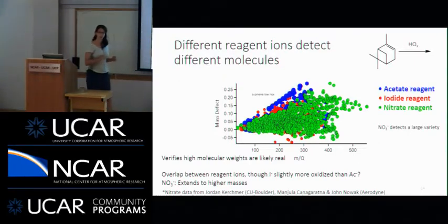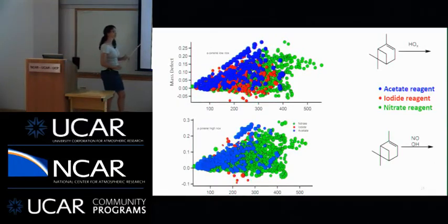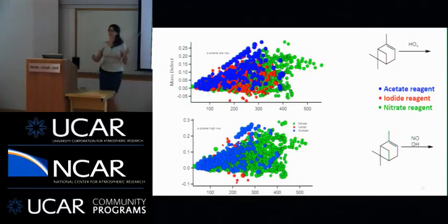Yes? Have you basically decided that those are all carbon, hydrogen, and oxygen? They are not all. For the purposes of this figure, I believe we eliminated all the heteroatoms. Oh, no, that's not true. We actually included them, but this was a low NOx experiment, so there were almost no heteroatoms in here. So no nitrogen and sulfur in this figure. But in the next plot, I have the data from the exact same experiment, alpha-pinene plus OH, but in this case, we added NOx. Turns out there was some NOx in this experiment too, but not too much to be worried about.